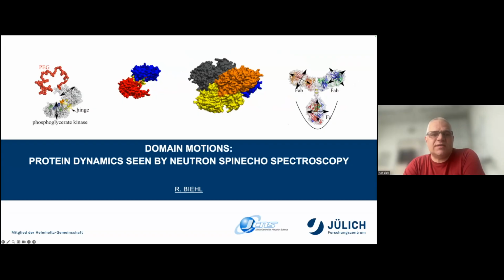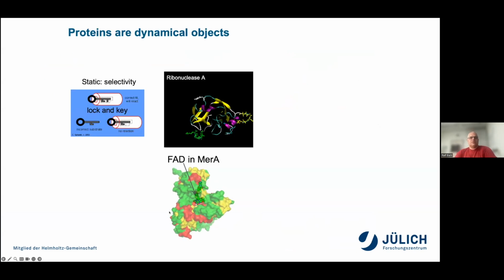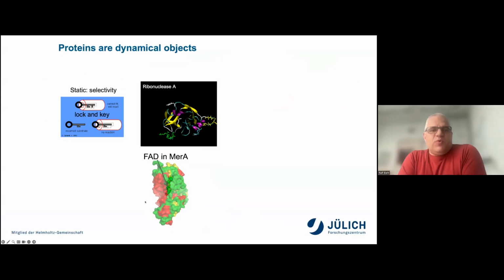Do neutron scattering, neutron spin-echo spectroscopy, and then look at domain motions in proteins. But first, proteins. You basically all know about proteins, how the structure is.